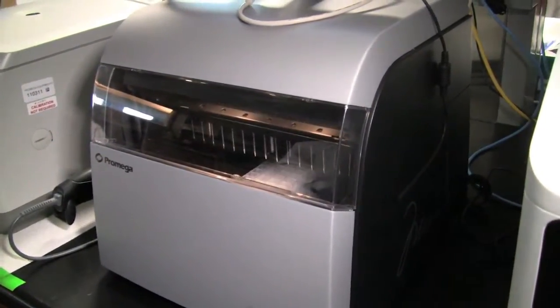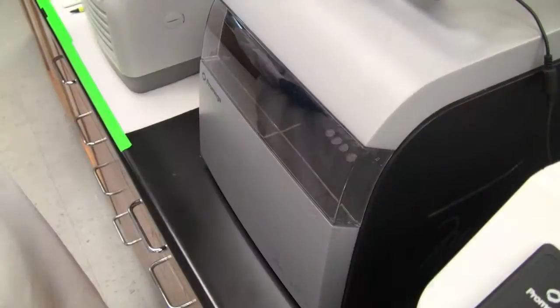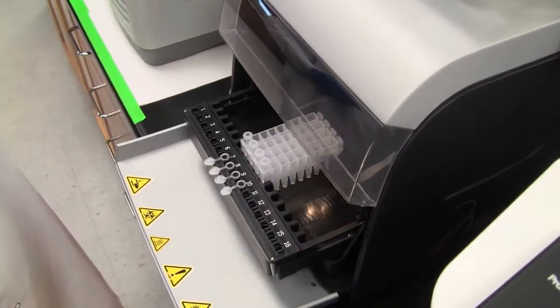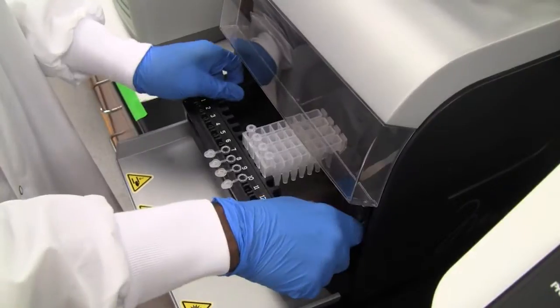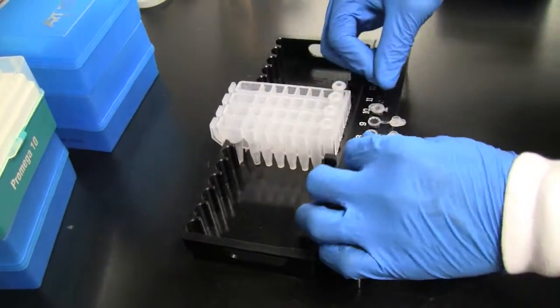When the run is complete, the screen will display a message that the method has ended. Follow the on-screen instructions to open the door. Remove the deck tray. Cap and remove the elution tubes.